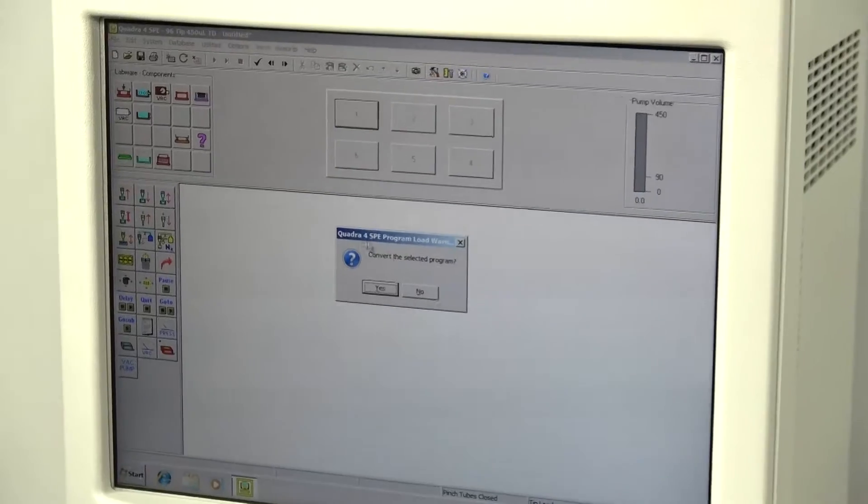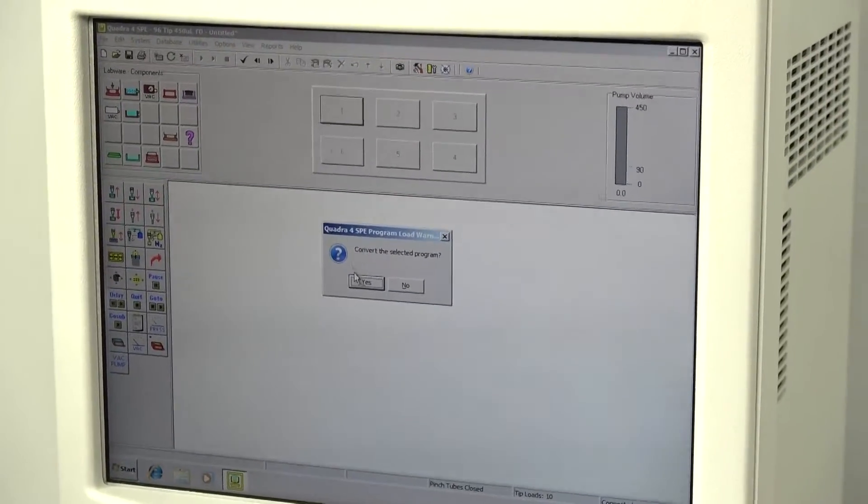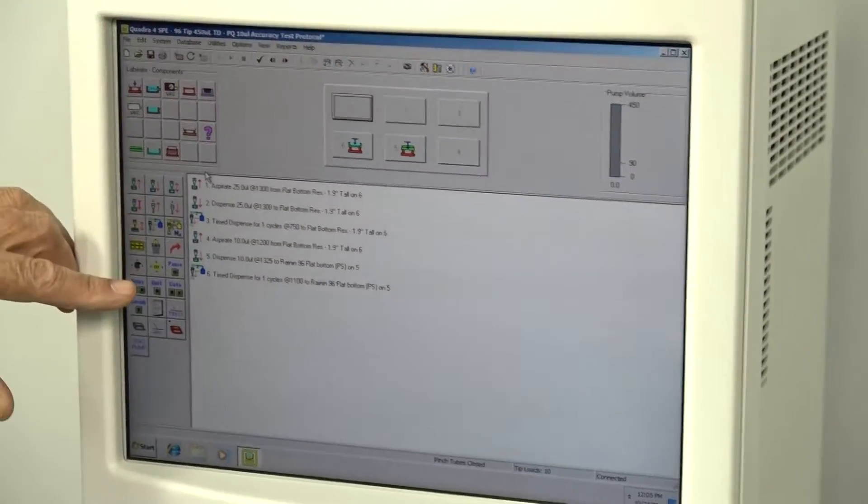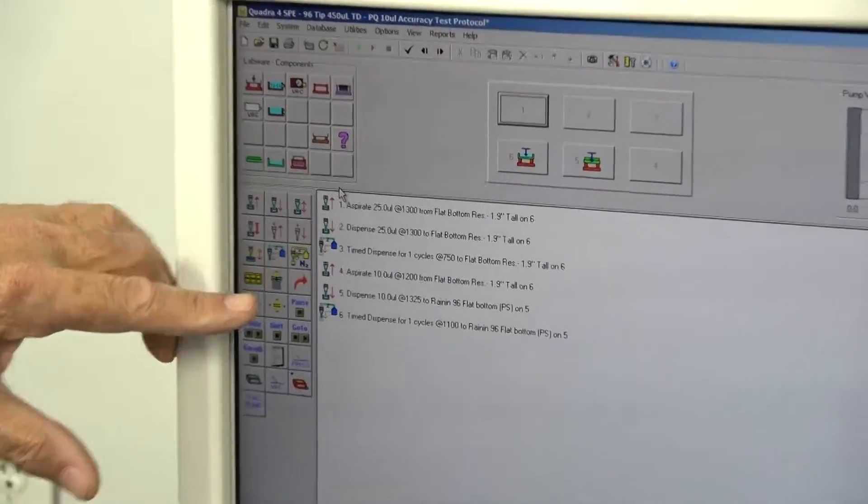We can open a program, it will convert automatically from older level programs. Loads the program, as you can see, it's a graphical interface, and it's easy to understand.